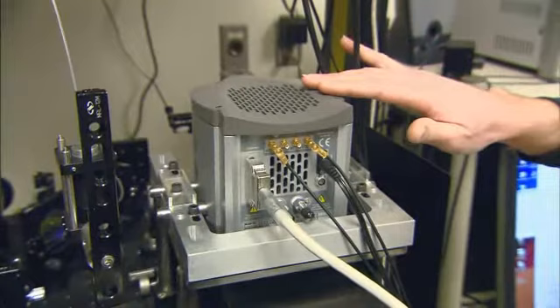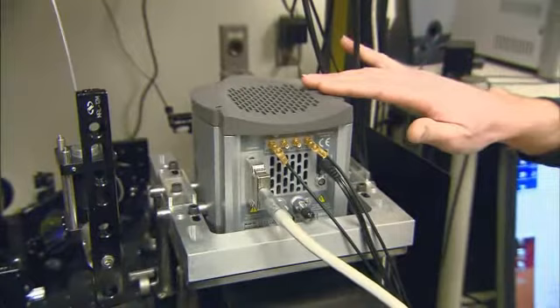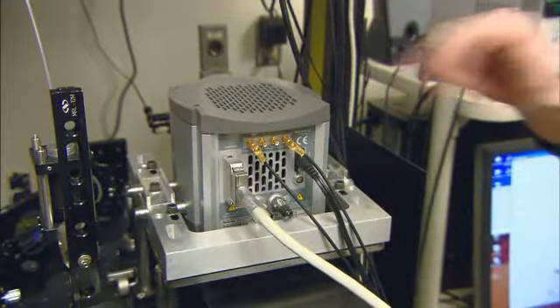What we've been able to achieve is we have the ability to record approximately 8,300 spectra per second, or roughly 8 megabytes of data per second we can acquire continuously with this system.